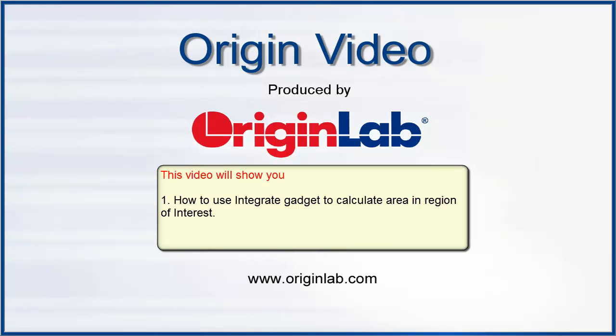This video will show you how to use Integrate Gadget to calculate area in region of interest, including how to calculate area between two curves.